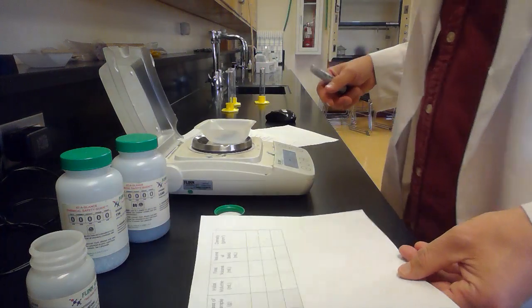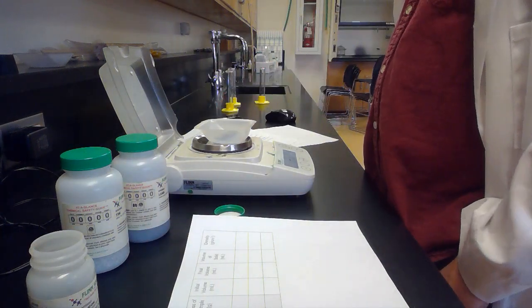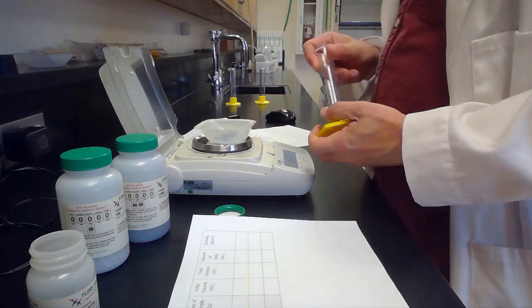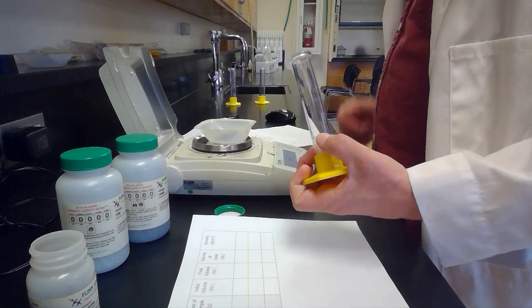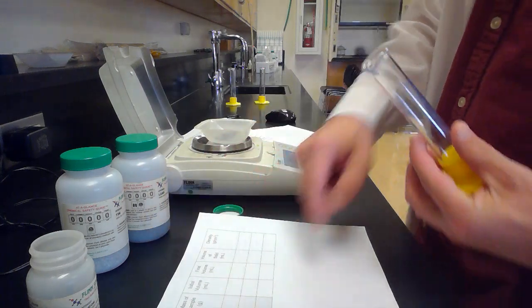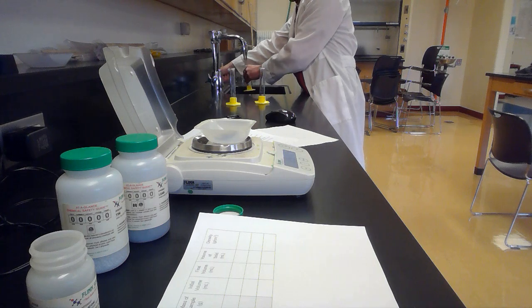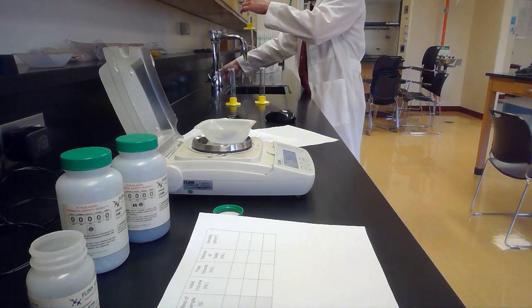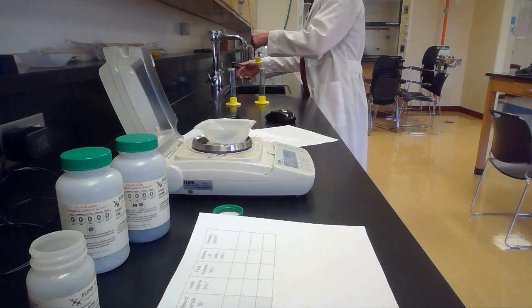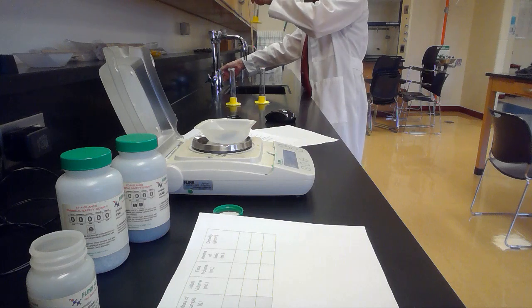All right, now, the third step, it says fill a 25 milliliter graduated cylinder about half full with water, and measure the initial volume of the water in our data table. So I'm going to put some water in here. And sometimes we might use distilled water, but for this particular activity, it doesn't really matter. I'll just use tap water.